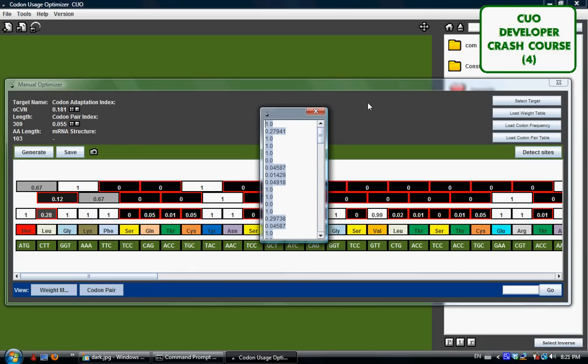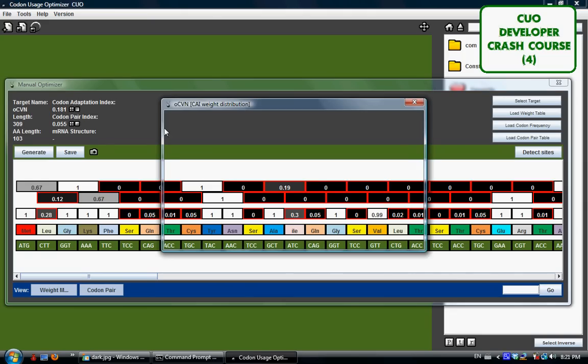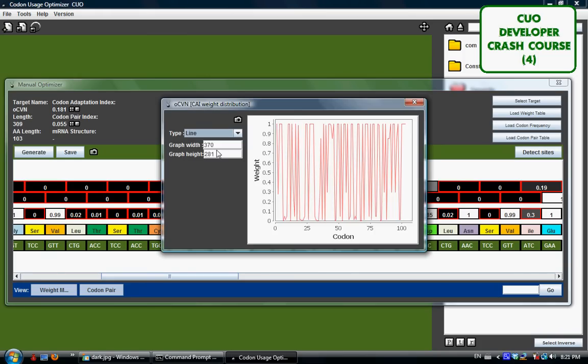The next button here is a very small graph-like button. You can see it roughly, but it's a graph. Once you click it, it will show you the graphical representation of your data in these graphics here. It's commonly more useful for people to visualize their data in a graphic way, let's say a line graph.